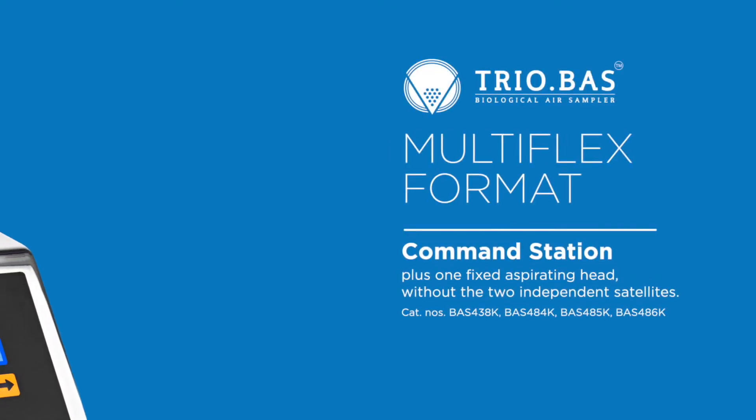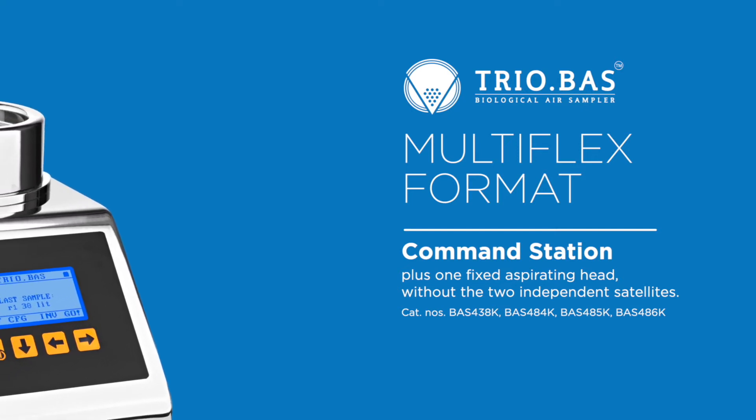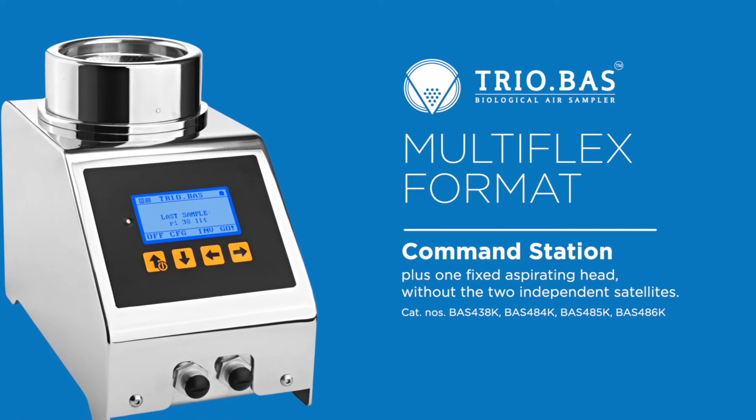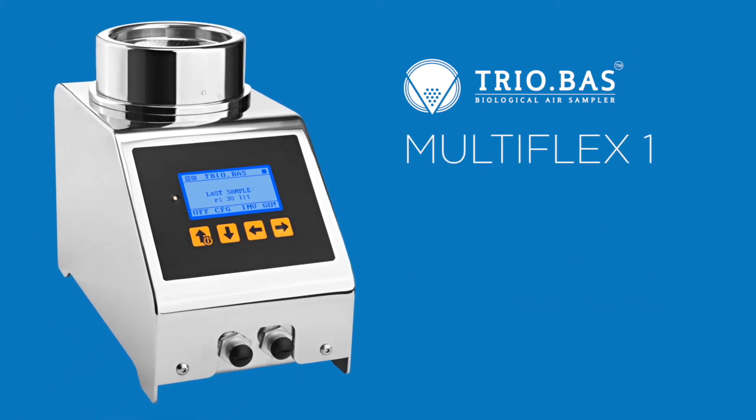The Multiflex format is also offered as a command station plus one fixed aspirating head, without the two independent satellites. This model is called the Multiflex 1.